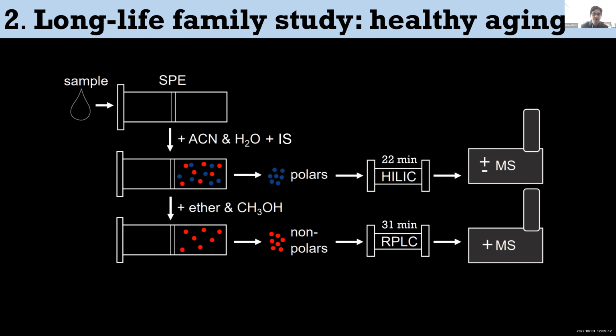I wish we could add more internal standards, but unfortunately, some of the other mixes and standards that we wanted to add were approaching the $1 million cost. It was beyond our budget for this particular study. Then we use ether and methanol to try to capture some of the non-polars.